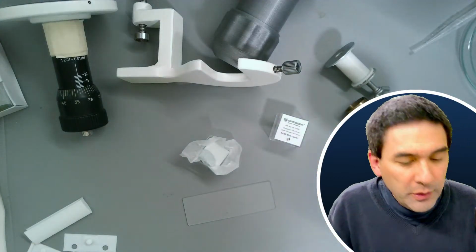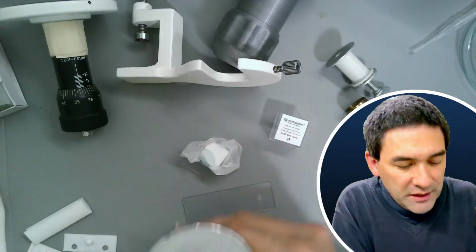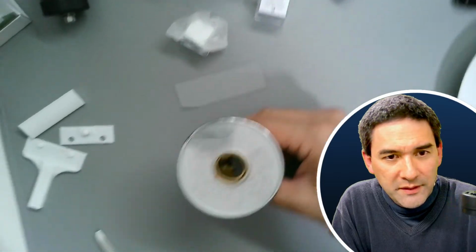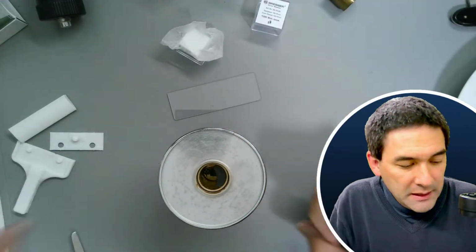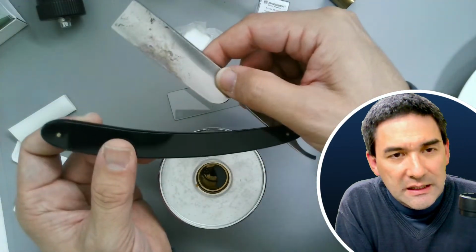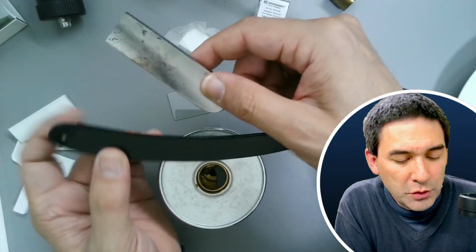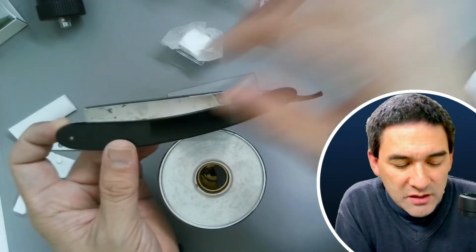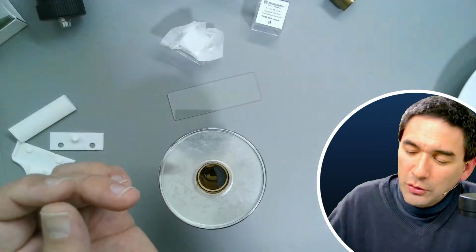Okay, how am I going to make a microtome cut? I'm going to use this one over here first because this is actually the easy one and the proven one to use. I do have this camera on the surface of the table. Let's move it a little bit like this. So, I'm not going to use this knife here. The reason is because I don't know how to sharpen it. I've not tried this before. I mean, I could sharpen it, but I need a wetting stone and these things. And as it is, it's too much work.